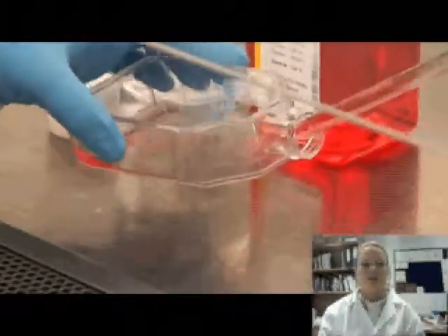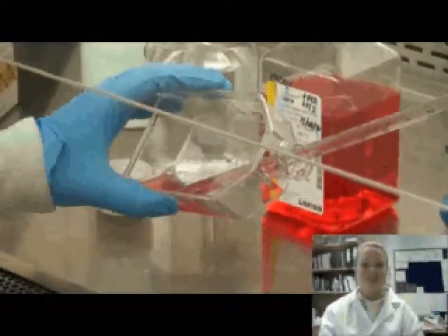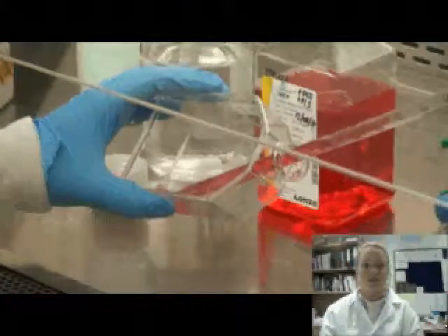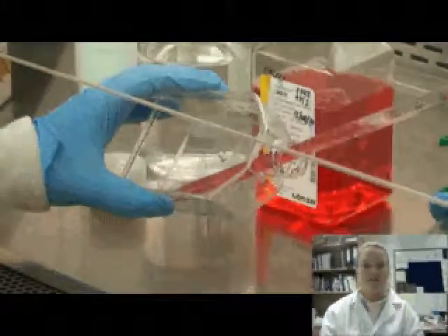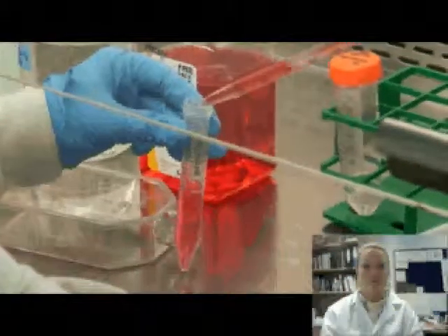I am now re-suspending the cells in 9ml of media. I am now transferring the cells to a falcon tube which I will then take upstairs to the lab to begin the next process of karyotyping, which is making chromosome spreads.